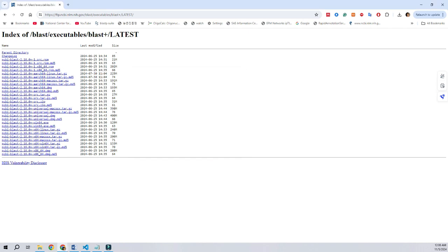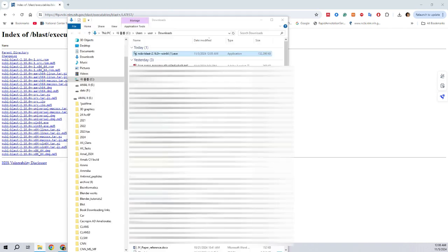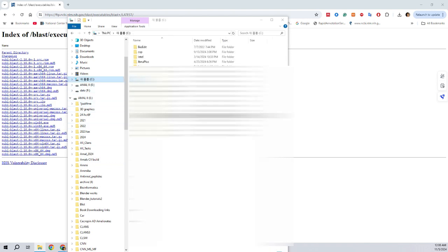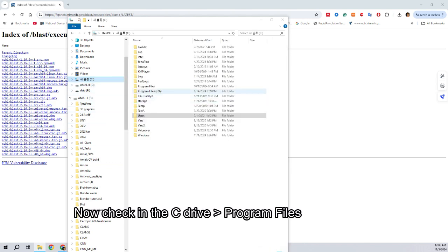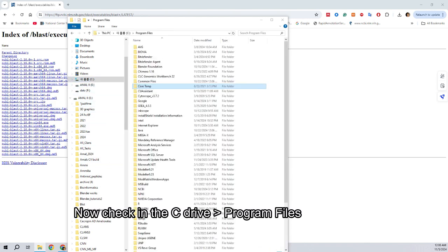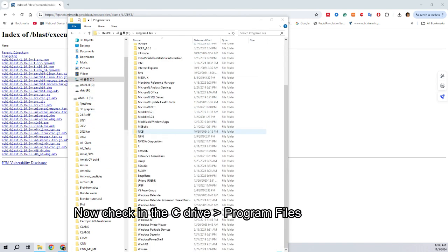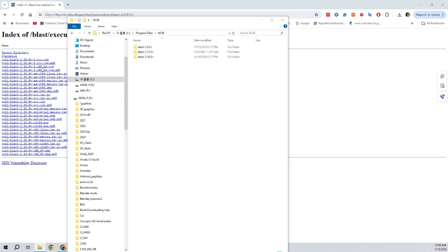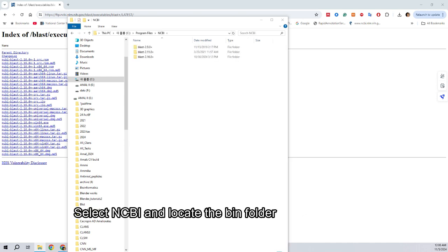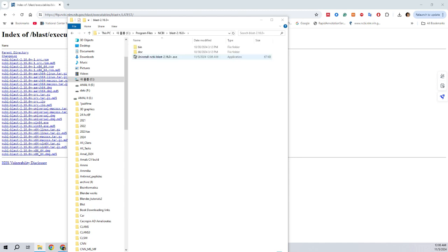Next, what we have to do is we have to set environment variables. Once it is done, we can use these commands anywhere, in any location or any folder inside your computer. For that, what we have to do is we have to locate the bin folder of the software installation and copy the path of it.